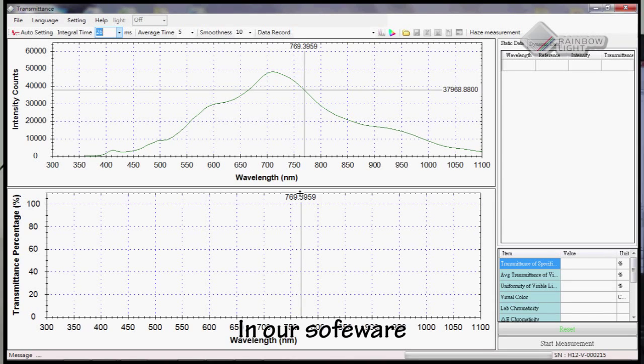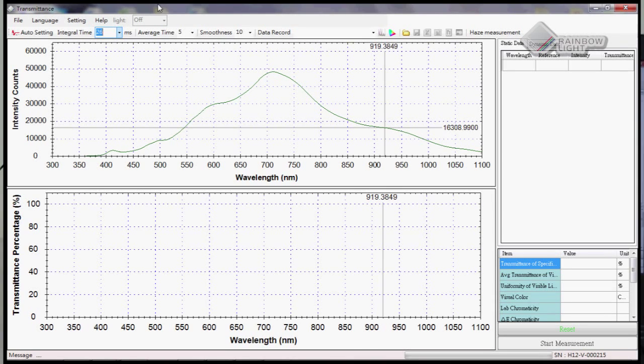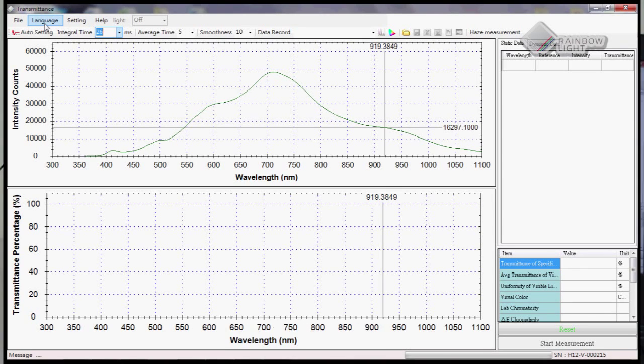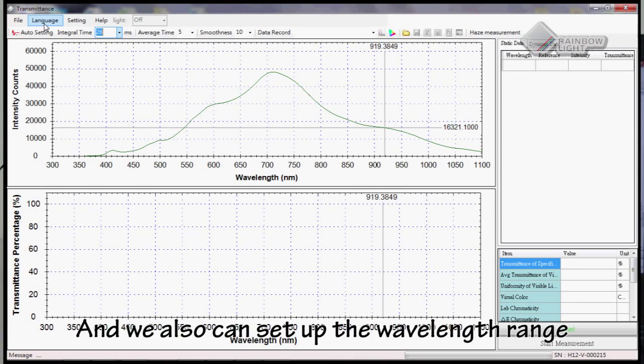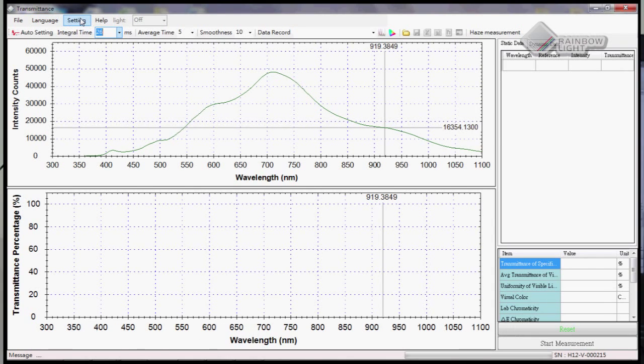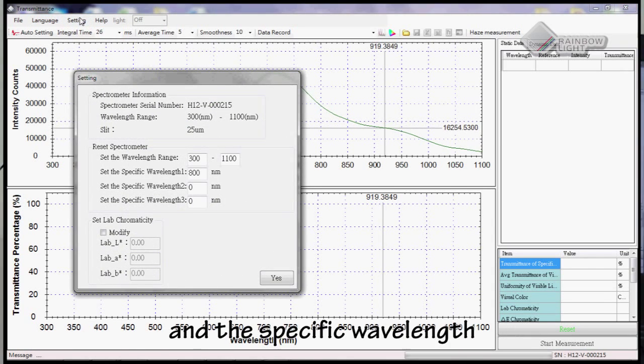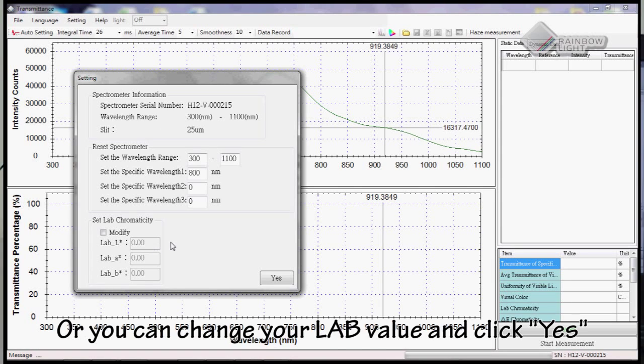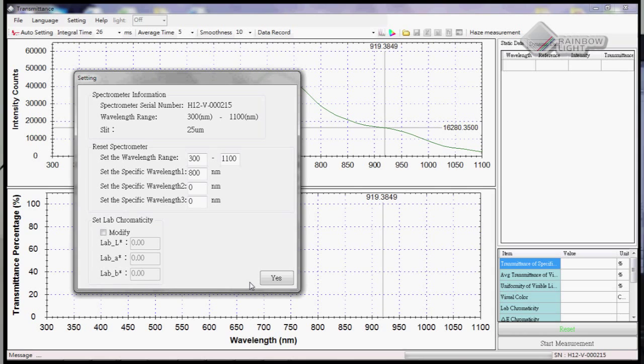In our software, we can choose the language and set up the wavelength range and specific wavelength. You can also change your light value and click yes.